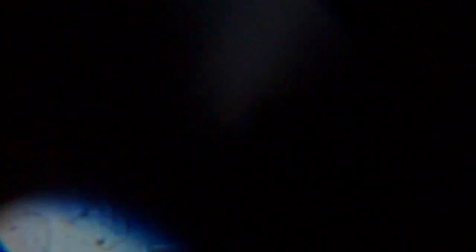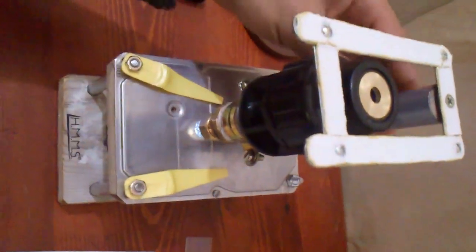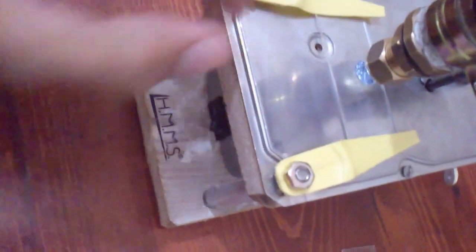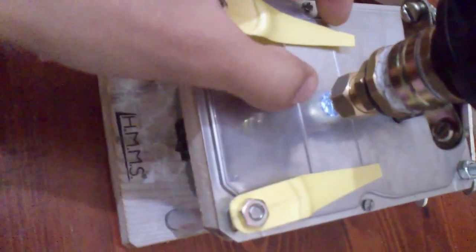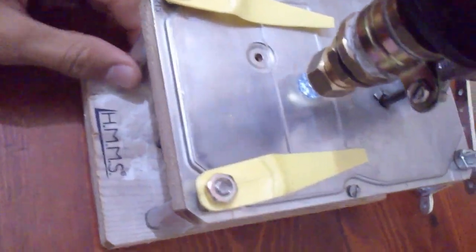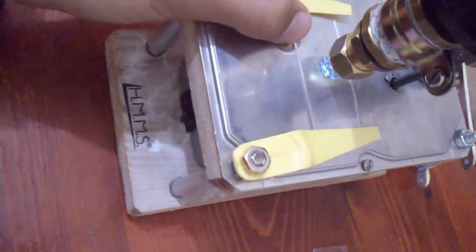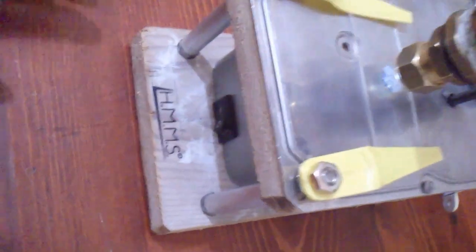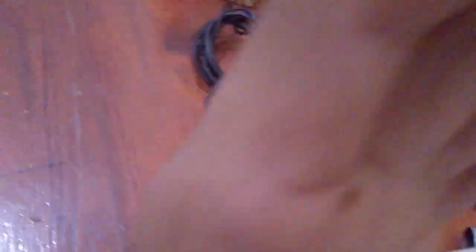This is pretty much it. This is the microscope. The support, as you can see, can be removed easily. I added these things that will fix this little piece right here to avoid its mobility, because it will lose the sight of the sample that we are watching.